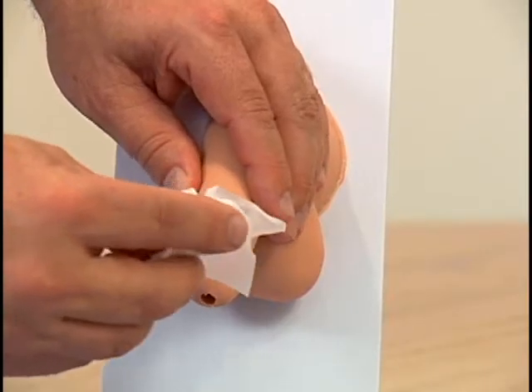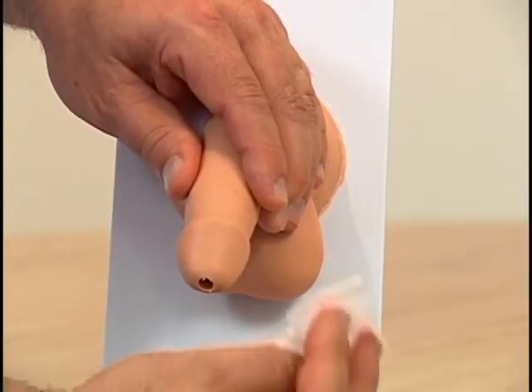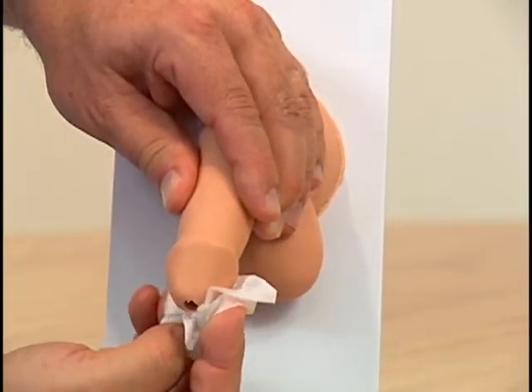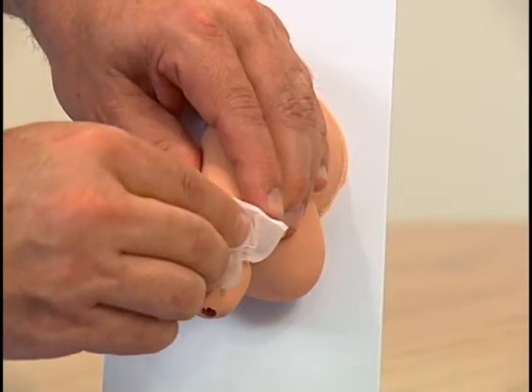Cleanse the area around the meatus and the urethral opening or urinary orifice. This is done by cleansing each side of the meatus with a separate antiseptic towelette. Discard each towelette in the toilet after use. Cleanse directly across the meatus with a third antiseptic towelette and then discard the towelette.